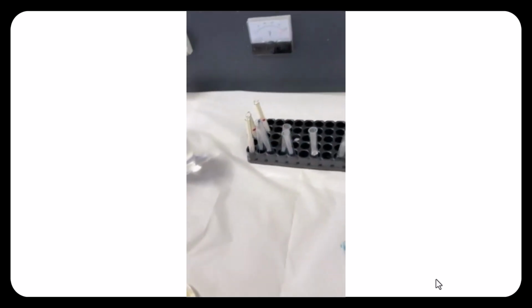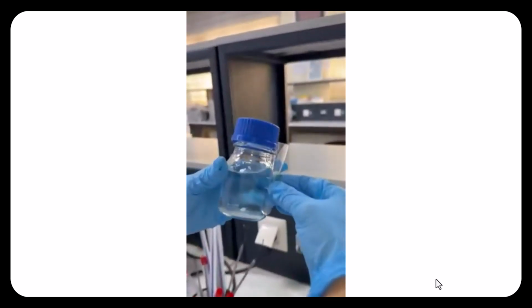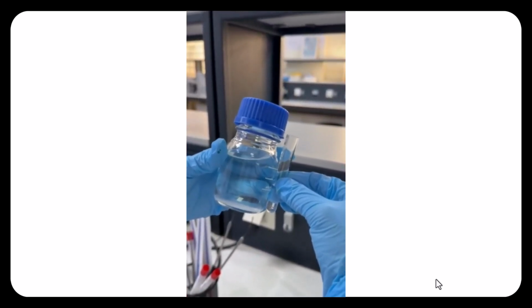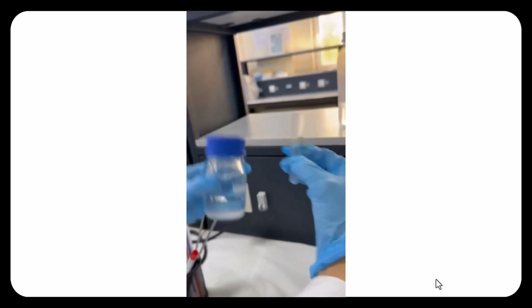As I mentioned, if we have the turbidimeter, we measure the turbidity, and the turbidity should be 0.5. If we don't have the turbidimeter, we compare with a McFarland standard, which is a special standard 0.5. If both are similar to each other in turbidity, it is ready.